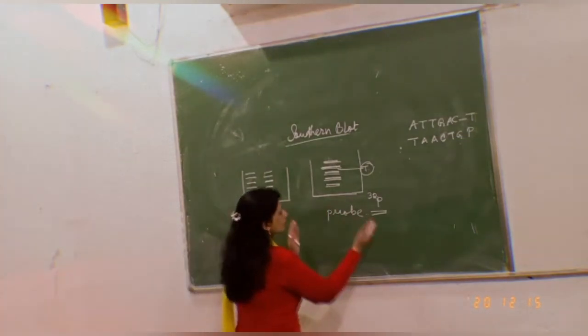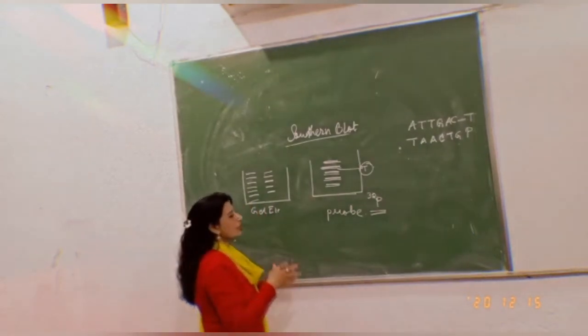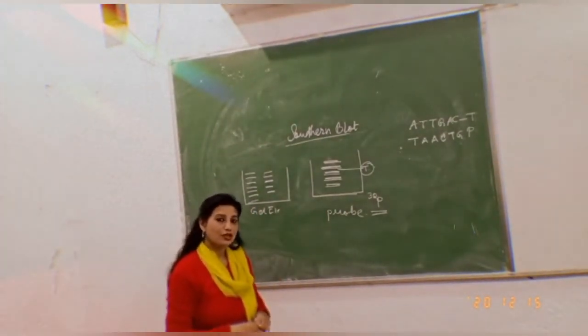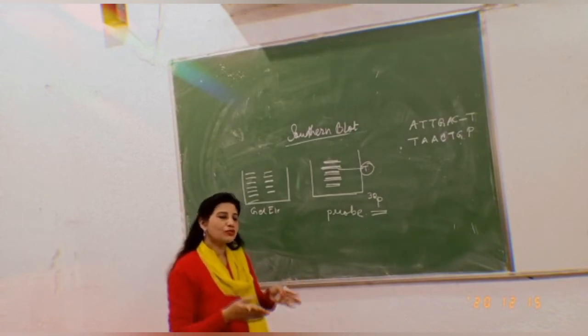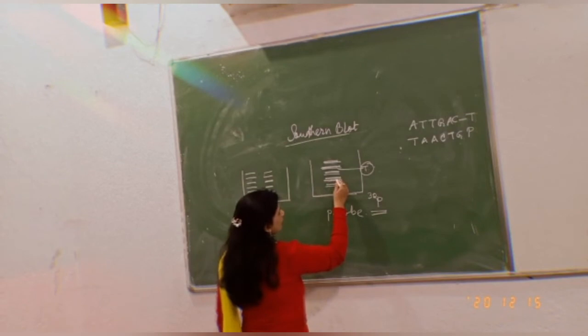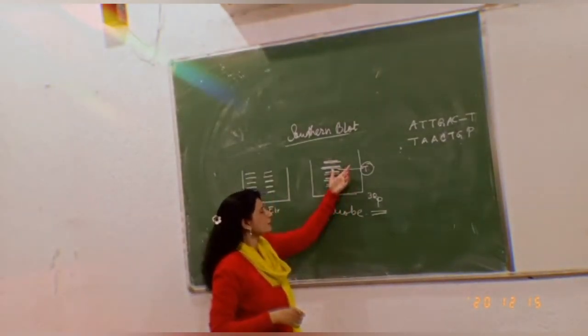So after the whole process, what I have done is use nucleic acid hybridization, the hybridization method. At probing time I will be using it. First it was denatured, then again the single strands were joined by the probe. The probe will locate that yes, this is my matching one. As my target is this, the probe will match with this strand. So it will go ahead and make a particular double stranded helical structure there only.